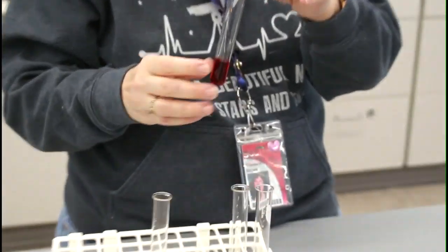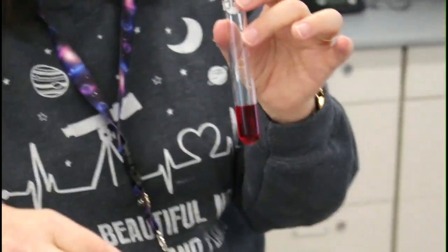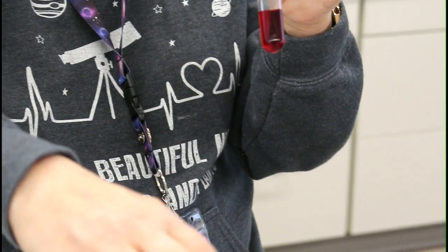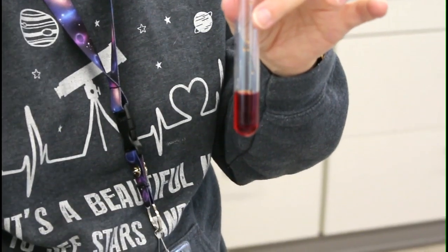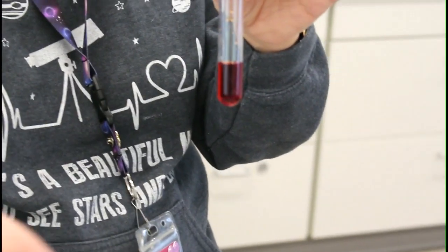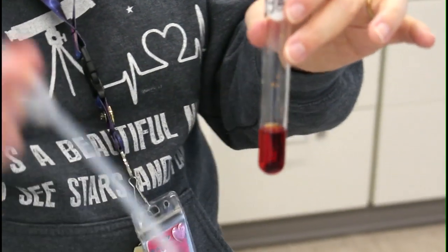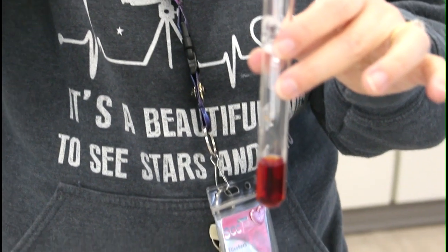Okay, the third way I'm going to stress the system is to add sodium hydroxide. If you read your background information, what sodium hydroxide is going to do is complex with your iron 3. So it's like removing iron 3. We can't physically reach in there and pull out the iron 3, so we have to do it a different way to take iron 3 out of our system. Very clever. Okay, so I'm removing a reactant. What will that do?